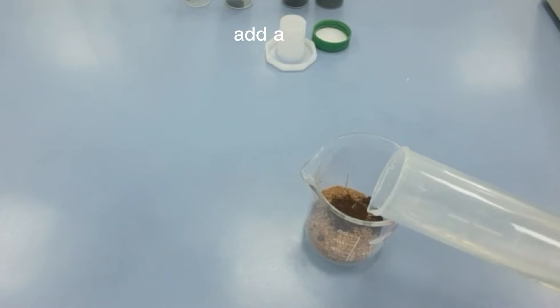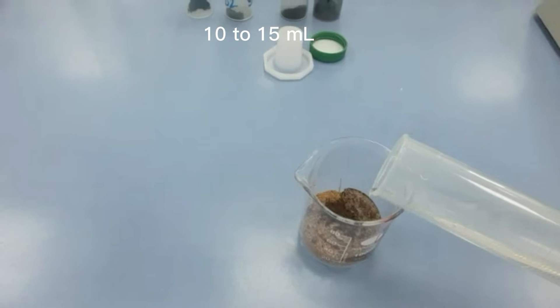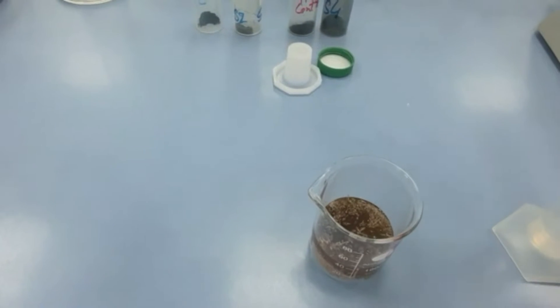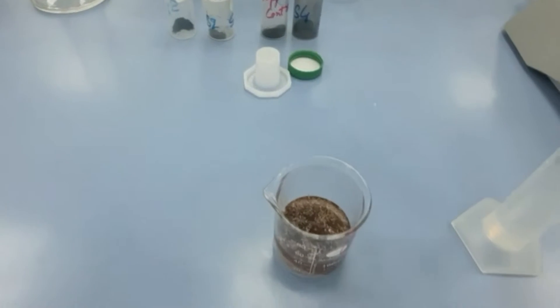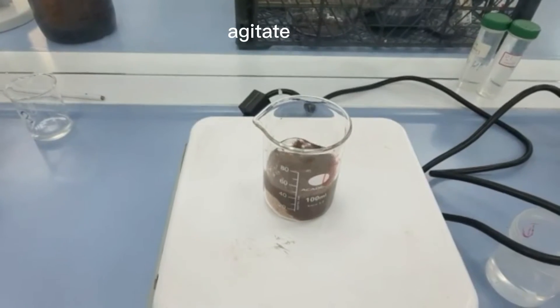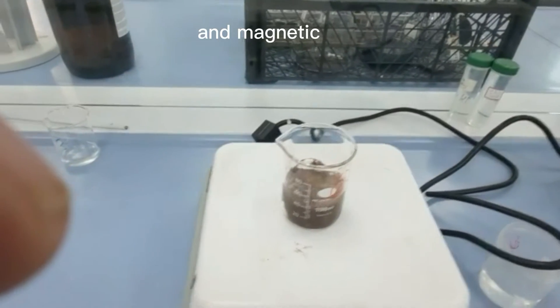Add a small volume of water, 10 to 15 ml. Agitate the mixture of date palm and magnetic particles.